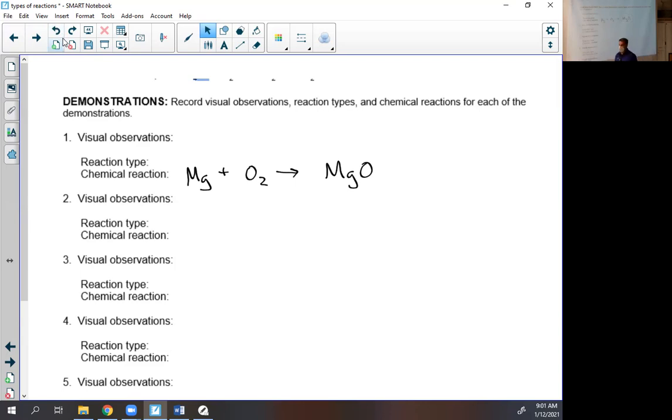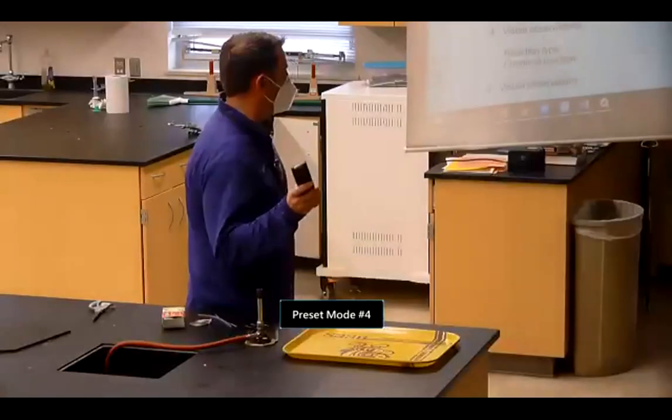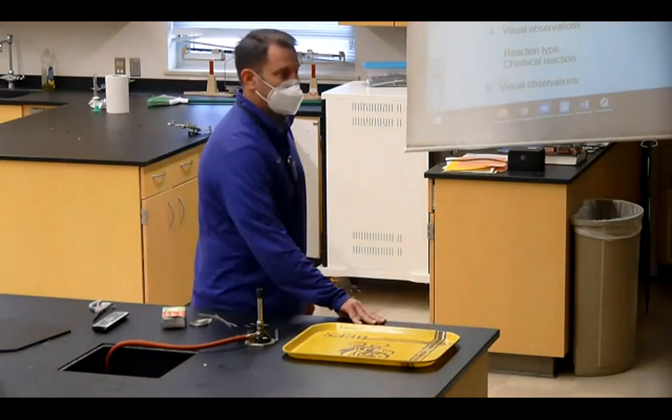Oh, I already had it over here. It's like over a week away. We still have to do all this. We have a couple labs and we have to apply math. So, well, I don't know. It might be about a week from today. All right, so here we go. Let's see if I did this right. We're going to go to preset 4. Oh, I did it right. I wrote it down. I cheated. Don't even worry about it.